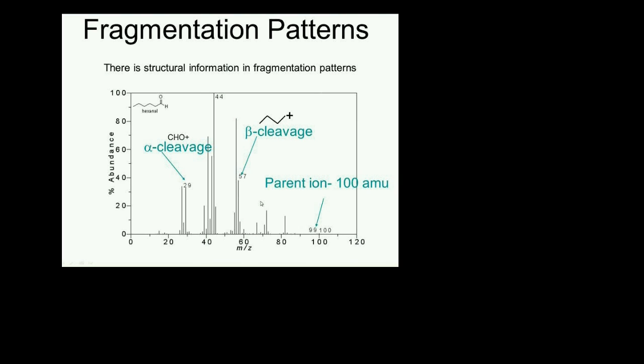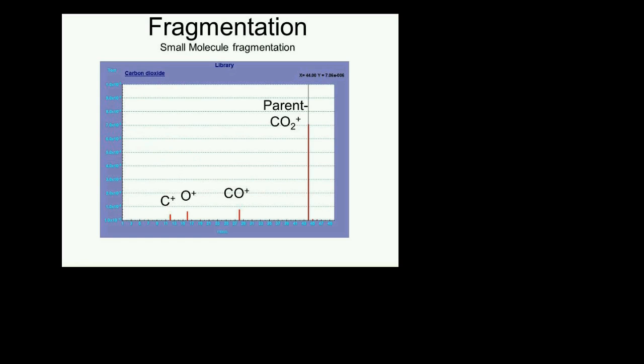So here's the deal. All these peaks could be interfering with other species that are in the vacuum system. So they complicate your spectra, and they might complicate your ability to understand the mixture. On the other hand, they allow you to identify these species a lot better. If I look at a spectral library and I can match most of these peaks to a spectrum there, I most likely got that molecule right. So, in other words, fragmentation is both your enemy and your friend. And I'm going to show you a perfect example of how fragmentation helps you in everyday application of an RGA.